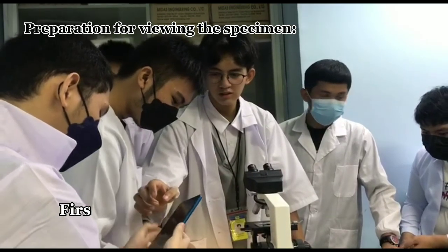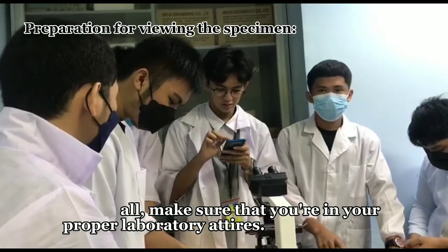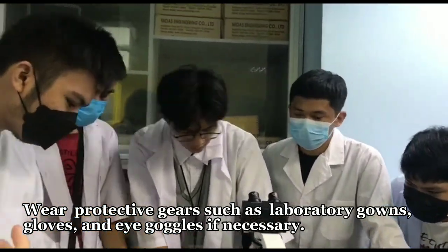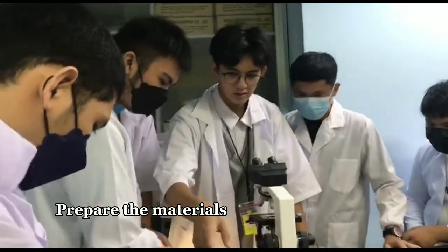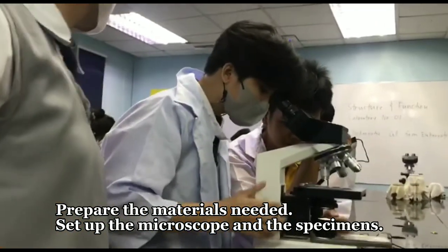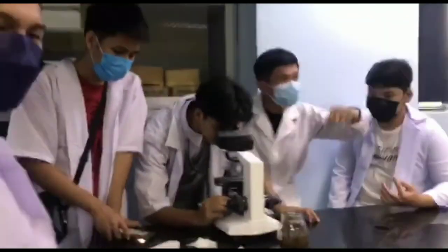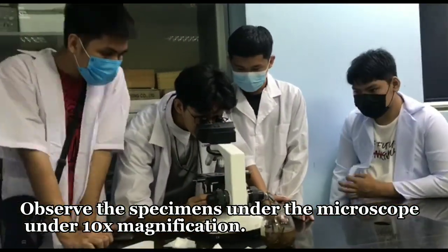First of all, make sure that you are in your proper laboratory attire. Wear protective gear such as laboratory gowns, gloves, and eye goggles if necessary. Prepare the materials needed, set up the microscope and the specimens. Observe the specimens under the microscope under the lowest magnification.